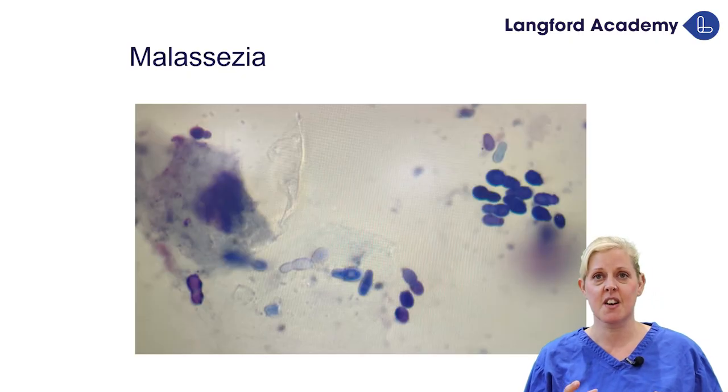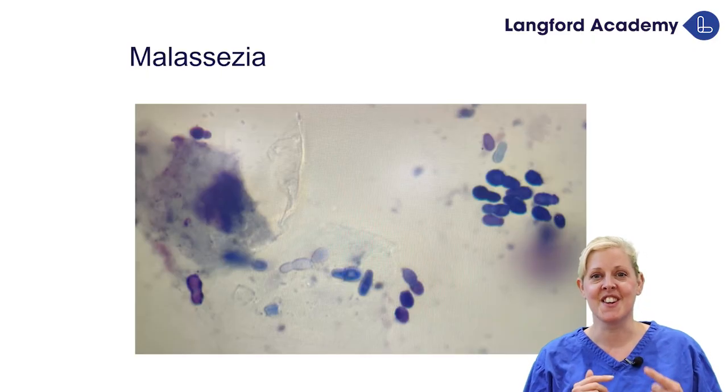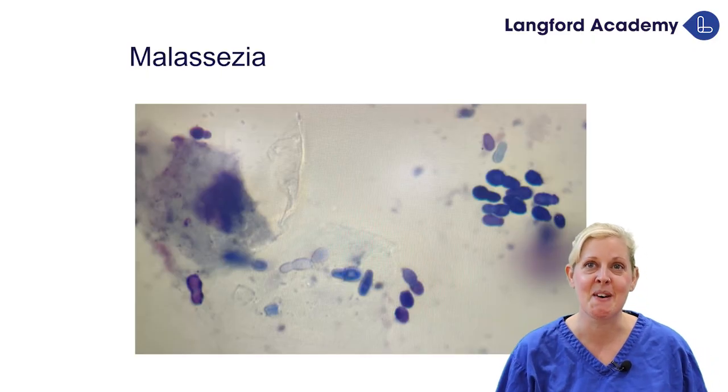So these guys, I've got a really good section here up around about the 2-3 o'clock mark. They are really, really beautiful. Spoken like a true microbiologist, I know. So these are described, it's got lots of different names, snowmen, peanuts, Russian dolls. My absolute favourite is footprints. I get a lot of enjoyment from thinking somebody's just walked all over the slide. Again, typical microbiologist, look at my smile.